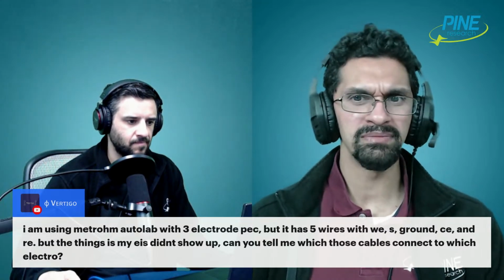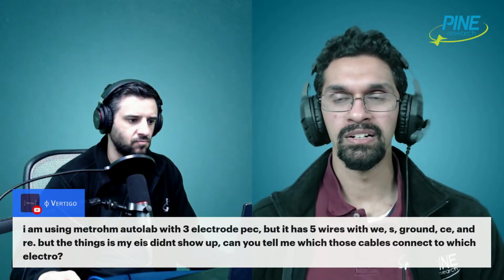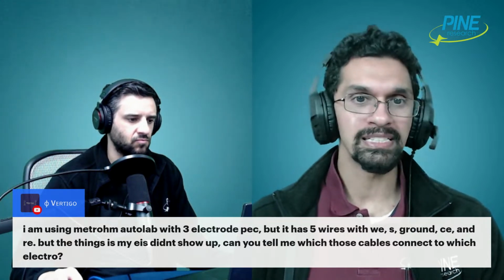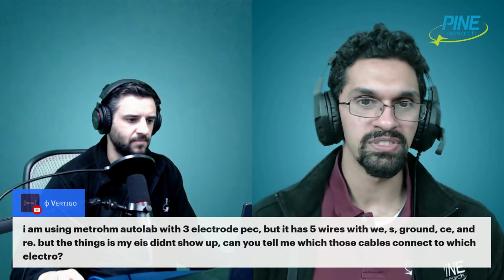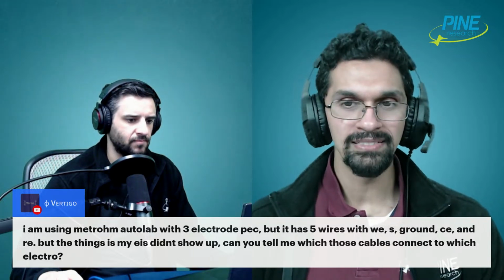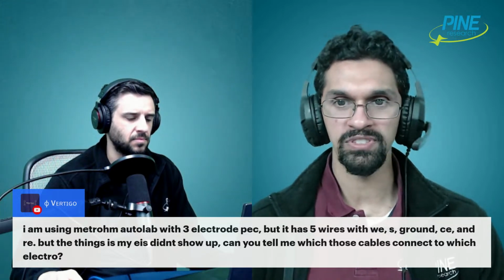Ground can probably be disconnected for now. You can also ground that to the instrument or to another piece of equipment, just to minimize electrical noise. CE is the counter electrode and RE is the reference electrode. If you have a 3-electrode setup, then WE and S need to be shorted together to the working electrode. CE needs to be connected to the counter electrode, and RE needs to be connected to the reference electrode.